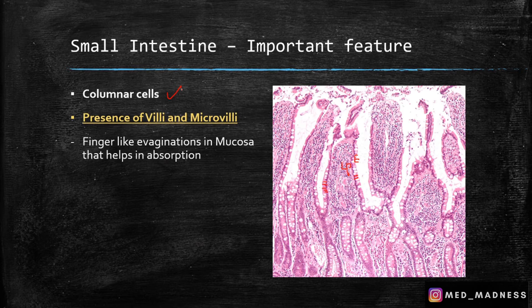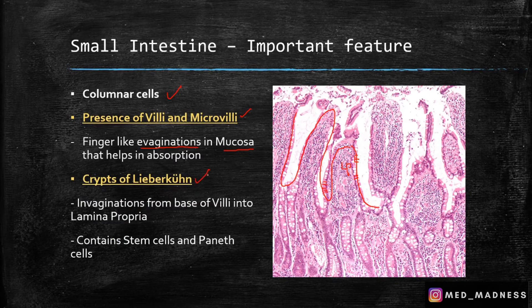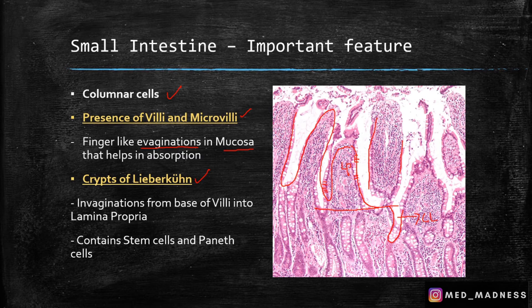The white ones are goblet cells, which help with mucus secretions. The most distinguishing feature of the small intestine is the presence of villi and microvilli — they are finger-like evaginations in the mucosa that help in absorption. Number two: crypts of Lieberkühn. This is the base of the villi — you can see some invaginations. This invagination from the base of the villi into the lamina propria is the crypts of Lieberkühn.